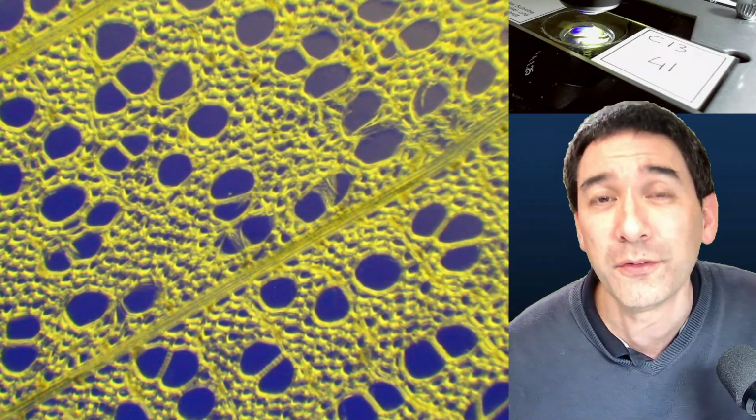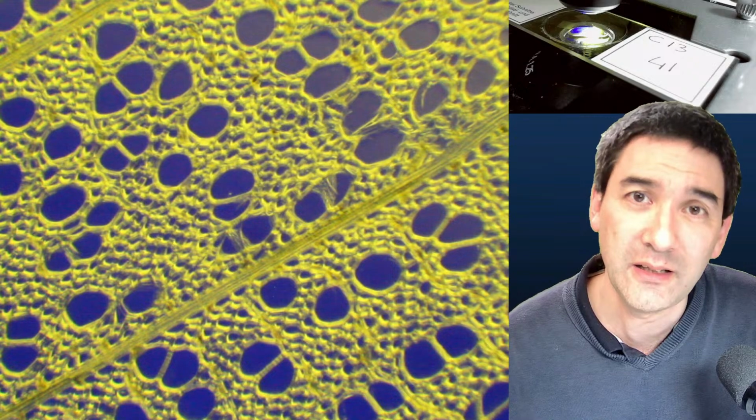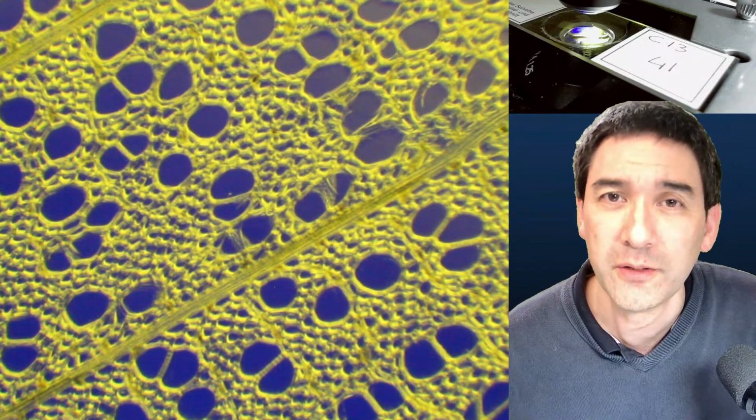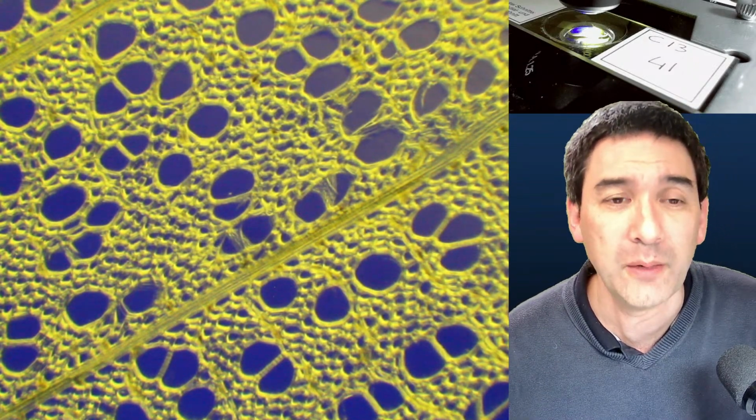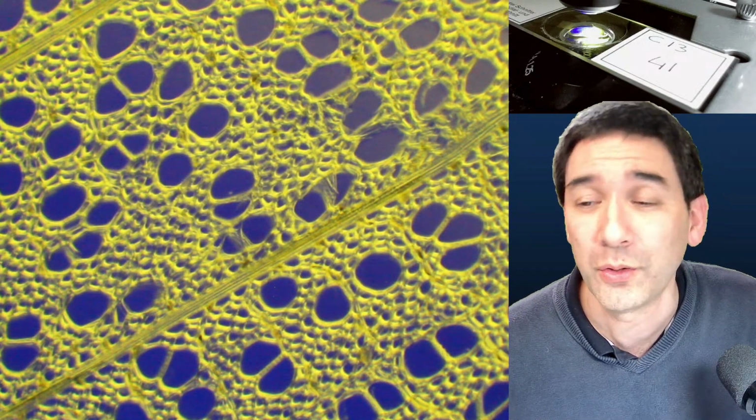Maybe there are other factors that are more important than whether it's halogen or LED. To a certain extent it's a question of taste, but I would say that, of course, LEDs are definitely the more modern way.